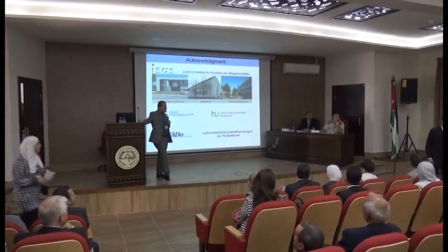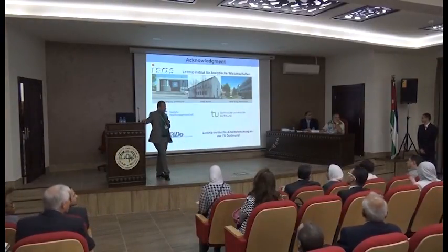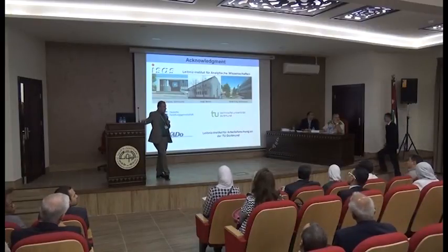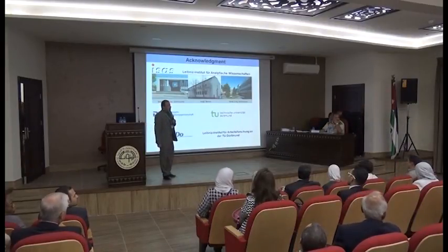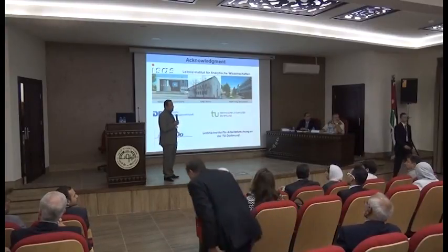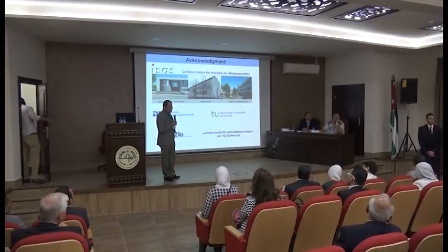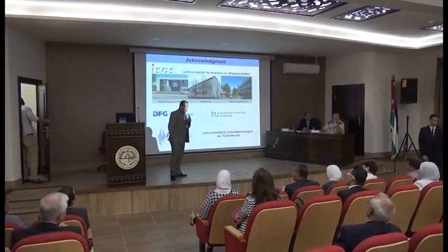Thanks, Dr. Ahmed, for this amazing presentation, which really grasped our attention. I'm wondering if you use a normal pulse for your cancer cells or a magic angle pulse, because I can't differentiate if you treat it as a liquid sample or a cell sample. Could you verify this?